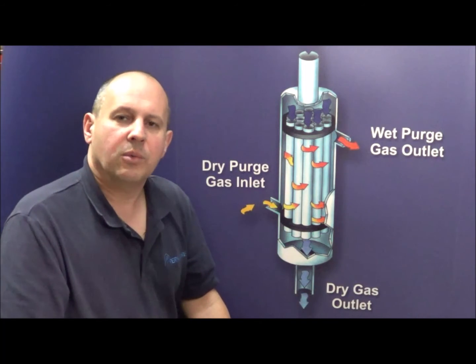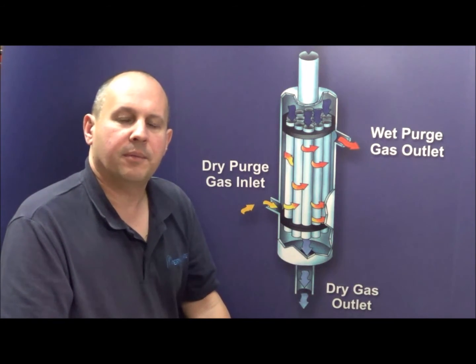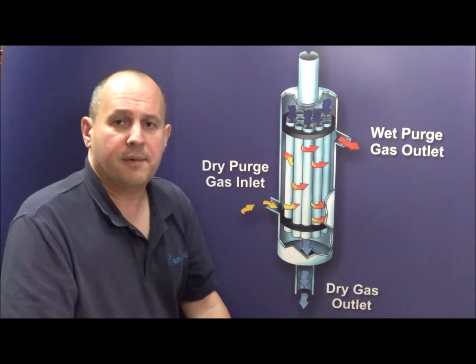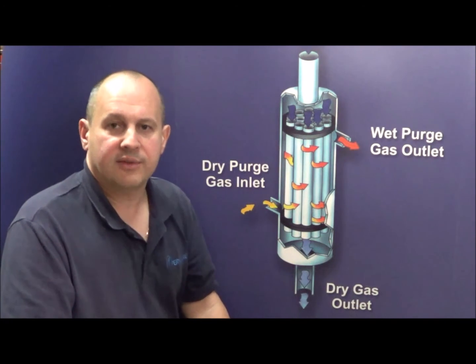Permapure manufactures a wide range of gas sample dryers, some with one tube and some with many tubes, for all the different types of flow rates that are normally found in the analysis markets.